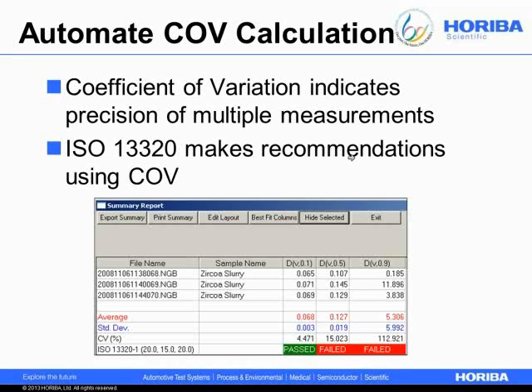So imagine you have a 1 kilogram jug in front of you that's filled with powder. If you shake it like it's been on a truck moving from point A to point B for a few days, a lot of times what you'll see is if all you do is sample from the top of that 1 kilogram jug, you're going to see a much coarser particle size distribution. And if you sample from the bottom of the jug, you'll see a much finer particle size distribution.